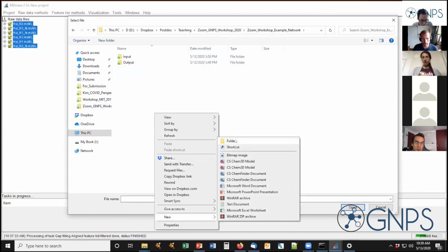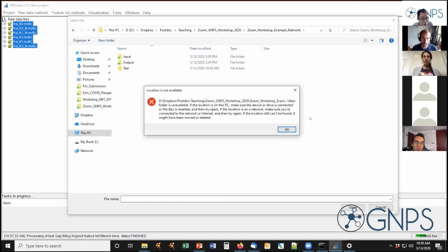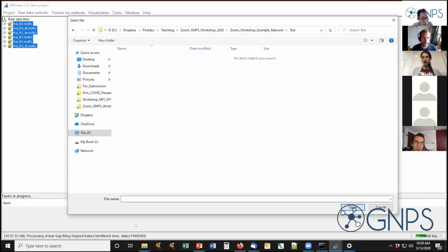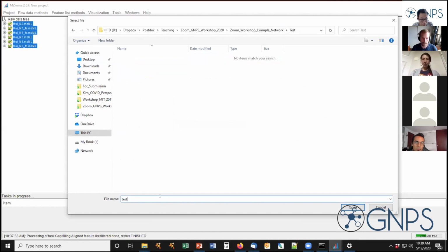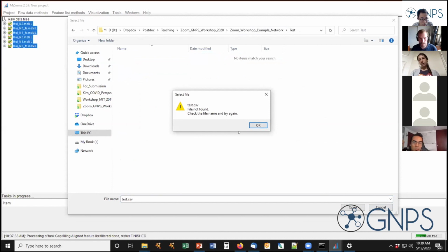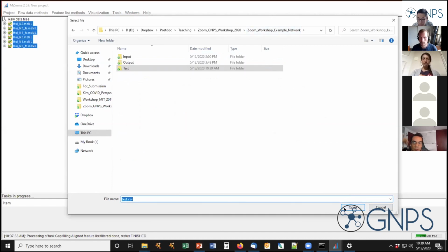Daniel, maybe when we're done with this, we can just real quick go through gap filling again. And also maybe we could talk about like, what are some of the benefits of gap filling and like why would we want to do it versus not want to do it with different data sets, maybe? That could be helpful.